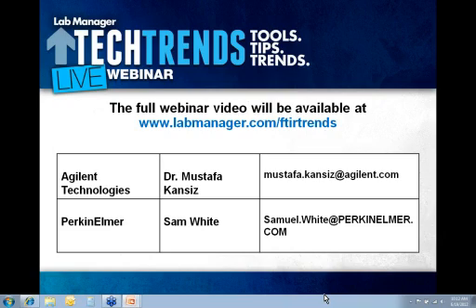Okay. All right. Moving on to the next question. Are either of you familiar with silica analysis in air by infrared? And is there any progress in direct analysis of the PVC filter? This is somebody who's in an industrial hygiene lab, and they wanted to know more about silica analysis in air.